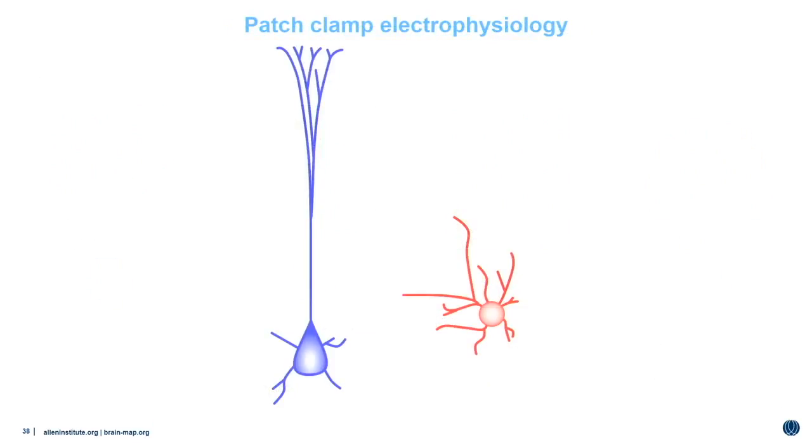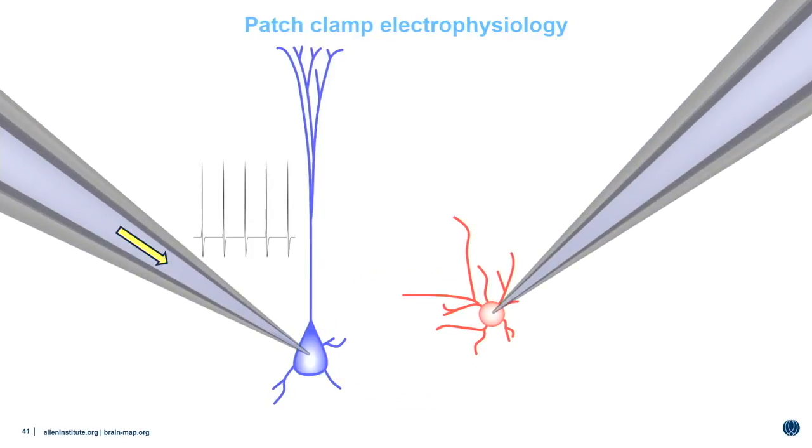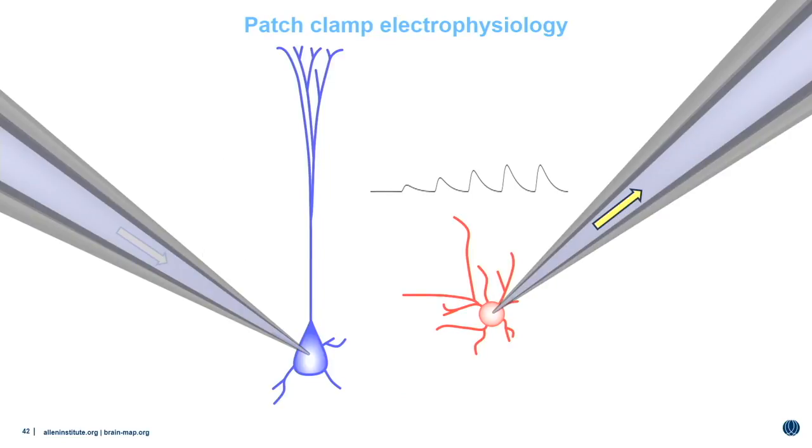We're using a very old and simple technique called patch clamp electrophysiology. The idea is pretty simple. We start with a piece of living brain tissue. We look for a couple of neurons. At this point, we have no idea if they're connected. So we attach a couple of microelectrodes to them. And then we can use one electrode to force this neuron to fire action potentials. And then we basically just record from the other neuron and find out if we see a response. If we do, then it's connected. Great. And we also have the option of playing with the timing of these spikes so that we can really probe the dynamic behavior of the synapse.